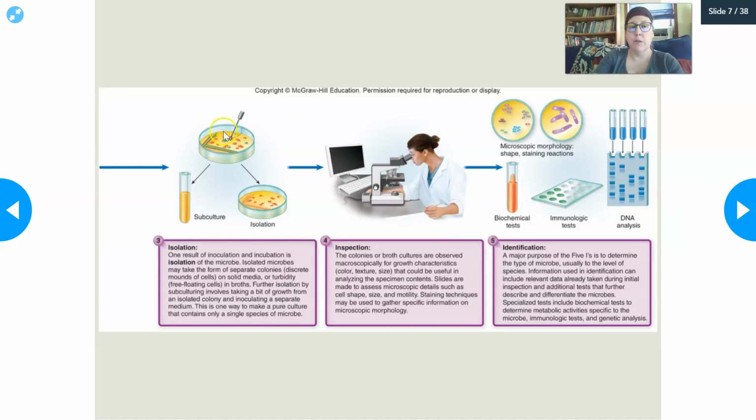So we had the plate with all the mixed organisms, the red, the yellow, and the white one. Well, you could take some of the red one and subculture it into a liquid broth or a plate, and have just that organism, so you can get it to multiply, you can get plenty of colonies, and you have plenty to test. You can do the same thing with the yellow organism and the white organism, so from one plate, if you did a liquid and a solid one, you would have 2 for the red, 2 for the yellow, 2 for the white, and plenty to work with.